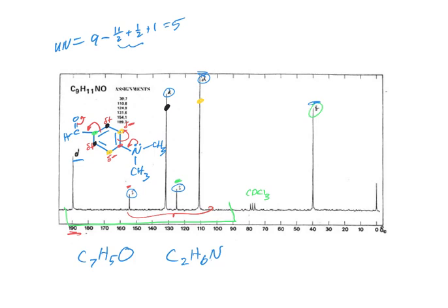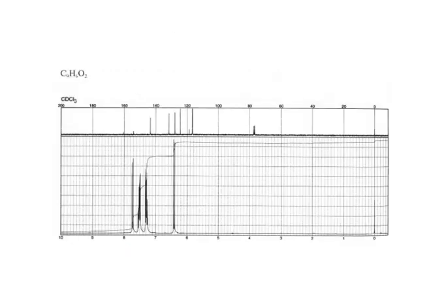And I think that's probably why the carbon next to the nitrogen is a little further downfield. Usually over 150 usually means it has more like an oxygen attached. But I think it's because of this electron withdrawing group, because that's going to also withdraw some electron density from the position with the nitrogen. So it's going to make it a little further downfield even than we would expect. All right, one more.